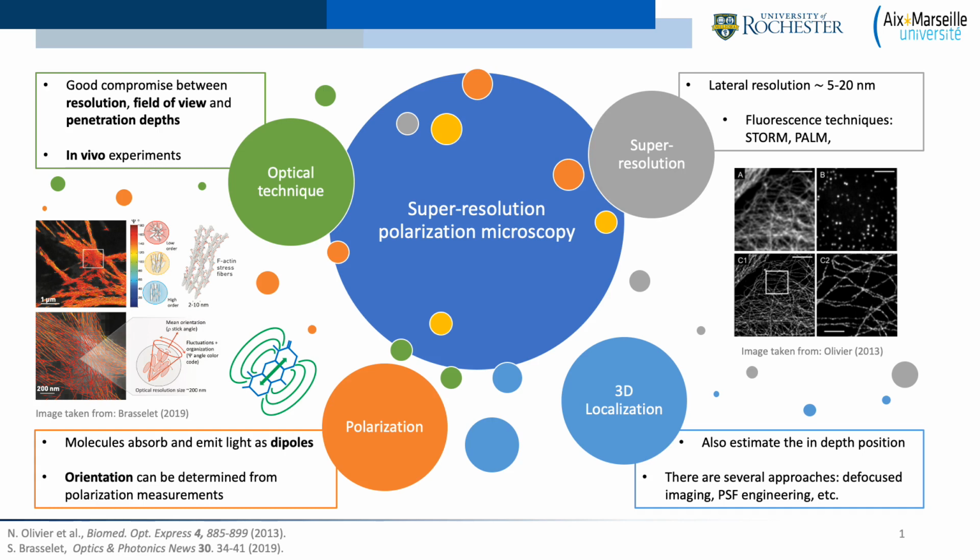Not only is lateral resolution important, in-depth position will also be required. In other words, we would like to know how defocused molecules are from the in-plane for the perfect in-plane image. And there are many approaches. We are basically interested in the ones that engineer the PSF.